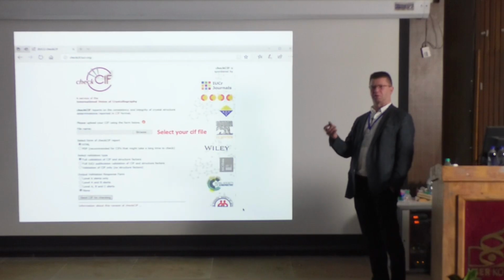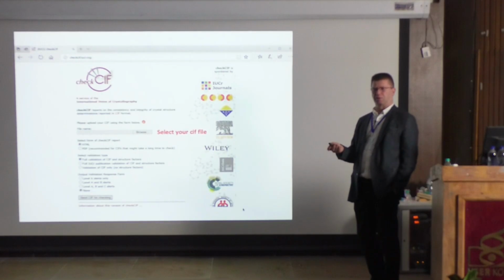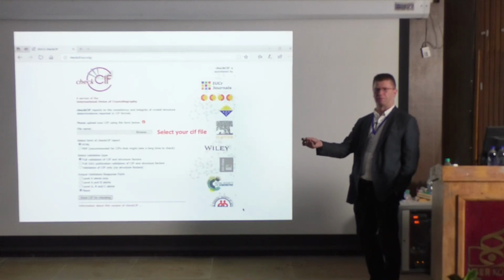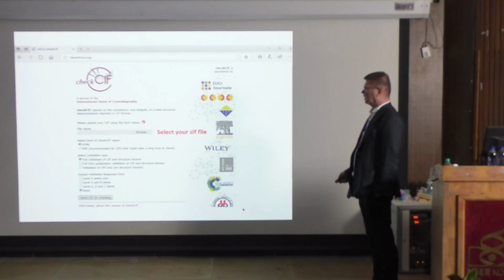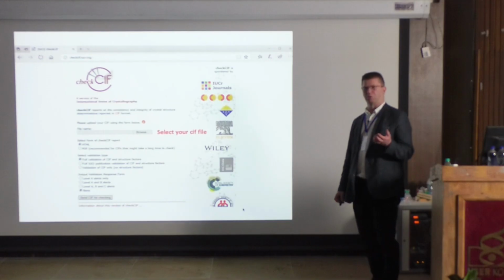We write the report as a PDF and then we keep it, and if we have to, we send it to the reviewers, to show that this is now done, everything is fine. And then there are different ways the validation is being done. And then finally, if there is something wrong, I will show you soon.